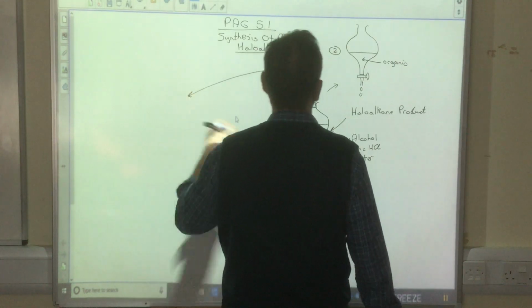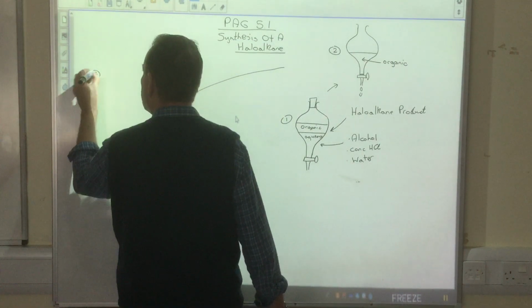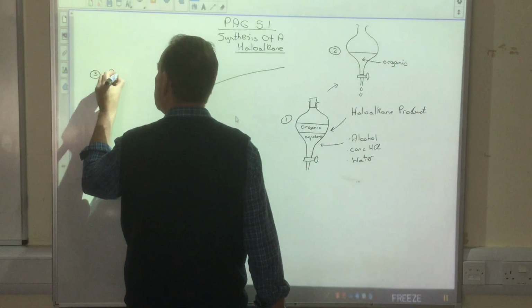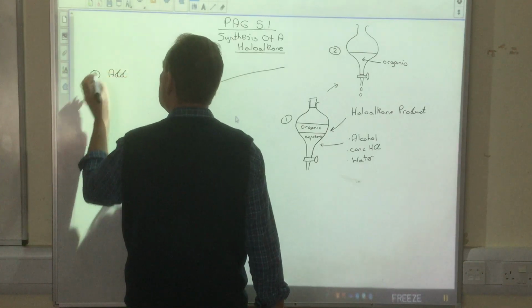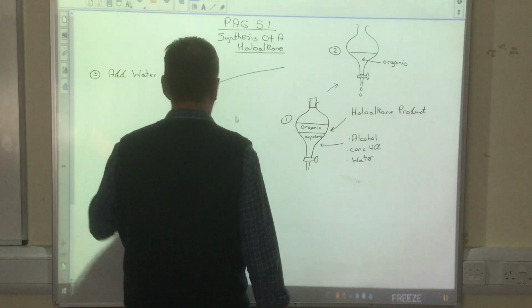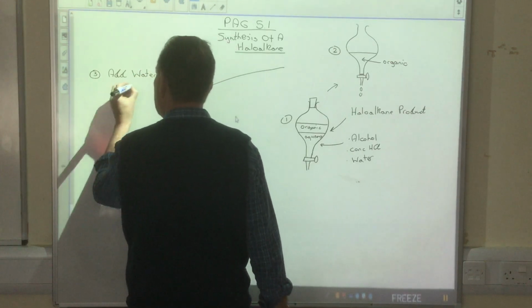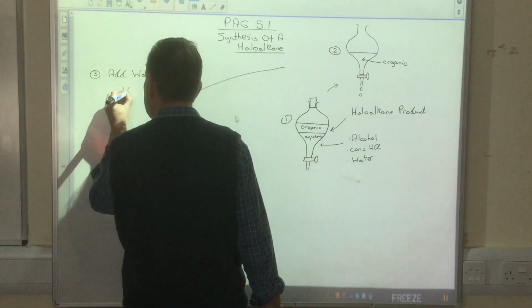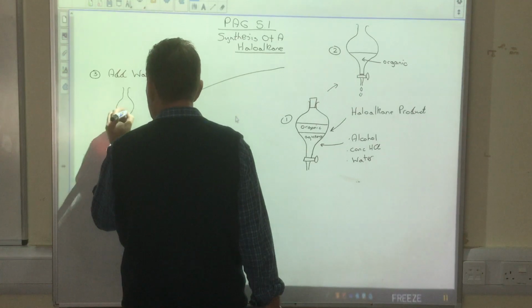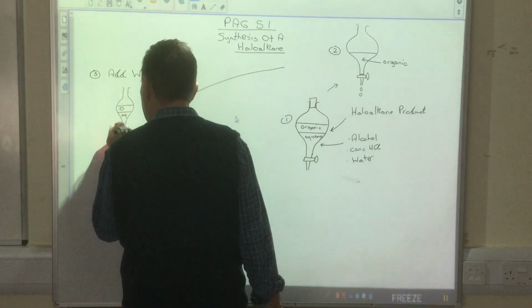3. You can use this to wash again and again. So number 3, you've got your separating funnel there. Add some water. Shake. Let it settle. Back to this. Creating another aqueous layer, but you've got rid of a load of stuff. Organic layer, aqueous layer. Tap.